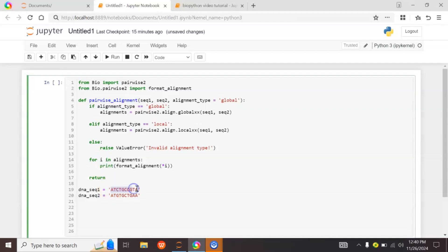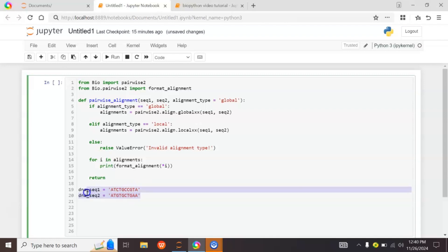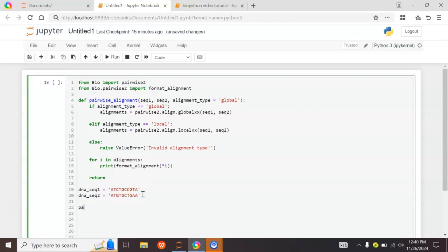You can provide a sequence of any length — 100, 200, or more. I'm giving a small example just to explain how this works. Then we call the function: pairwise_alignment(dna_seq1, dna_seq2, alignment_type='local').